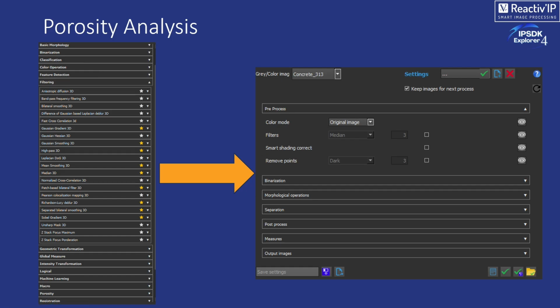So after discussing with all our users, that was one of the main requests. Can we just make something much easier to use? And that's when we created that. And it's a step-by-step process. We will guide you, so you don't need to go through all the chapters. You just say, okay, first I need to make pre-processing. Do I need to do that or not? But at any time, just click on the icon and you will get a preview.